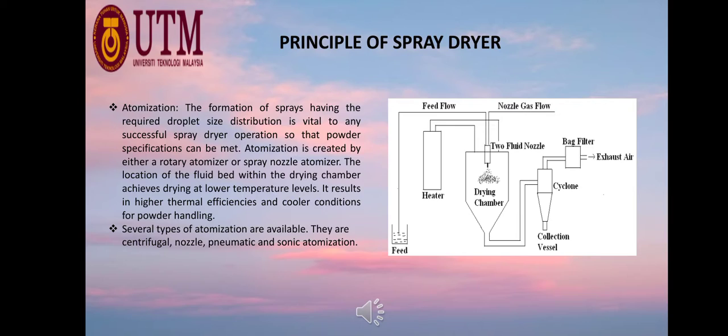In this principle, the formation of sprays having a required droplet size distribution is very important to any successful spray dryer operation, in order for the powder specifications to be achieved. Atomization is created by either a rotary atomizer or spray nozzle atomizer.